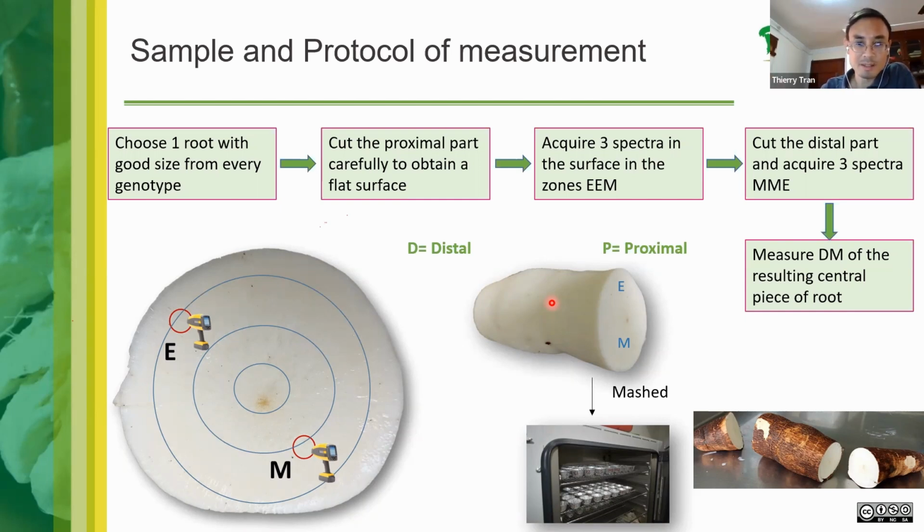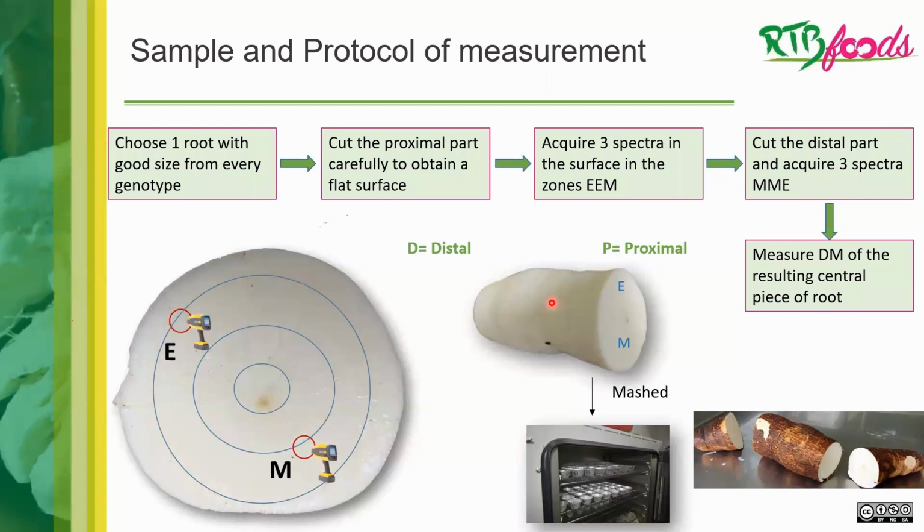The QualitySpec is on the table, correct? Yeah, that's exactly what I want to know, because the way the picture showed somebody scanning it, as if holding it, if you have a large number of samples, it's not feasible. You need good fitness.